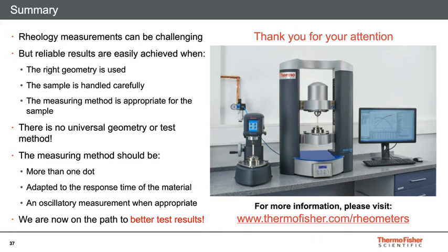So Nate, the first question I have asks, if I have a new user in the lab, how do I ensure they're running a test properly? Yeah, that's a common challenge, and that goes across, regardless of the type of measurement you're performing. I would say from our end, our instruments and then the Rheology software that I've talked about quite a bit throughout today's webinar, they're designed for that novice user.